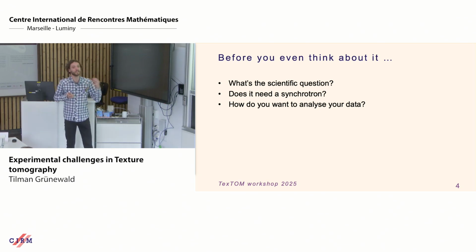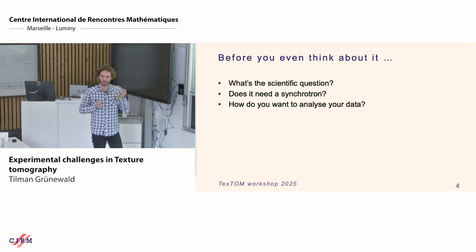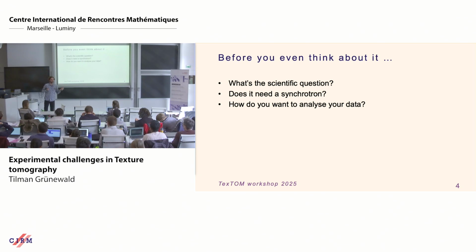So before you even think about doing an experiment, it's important to have a scientific question. I know that I'm preaching to the choir here, but it's really a lot better if you think your experiment through before going out on a fishing expedition, hoping to find something. Does it need a synchrotron? And what do you actually want to do with your data afterwards? I'm guilty of that myself. There's a couple of experiments that took me 10 years to analyze because I didn't know how to analyze my data. And we finally published it this year.